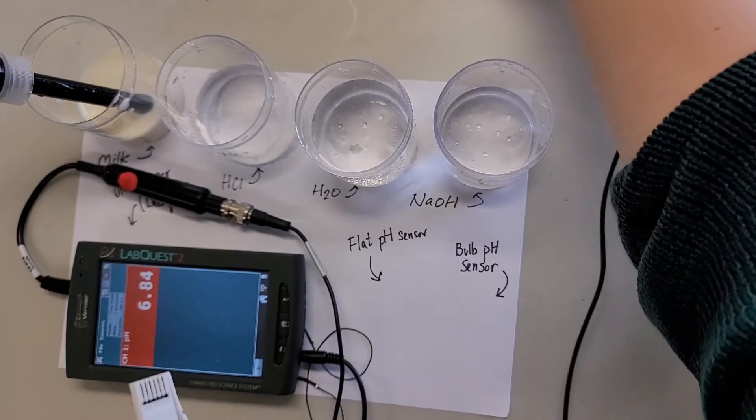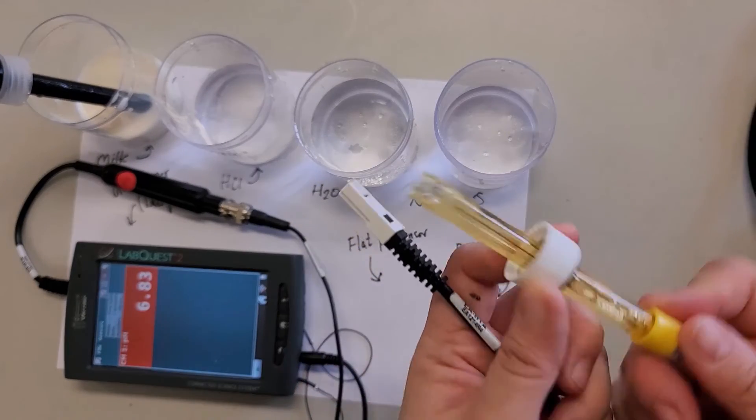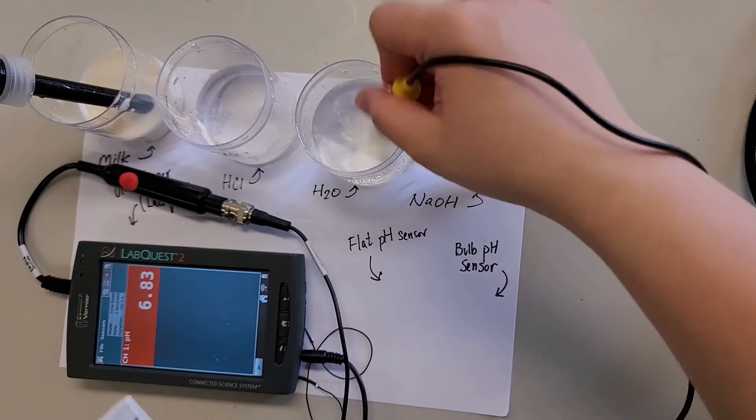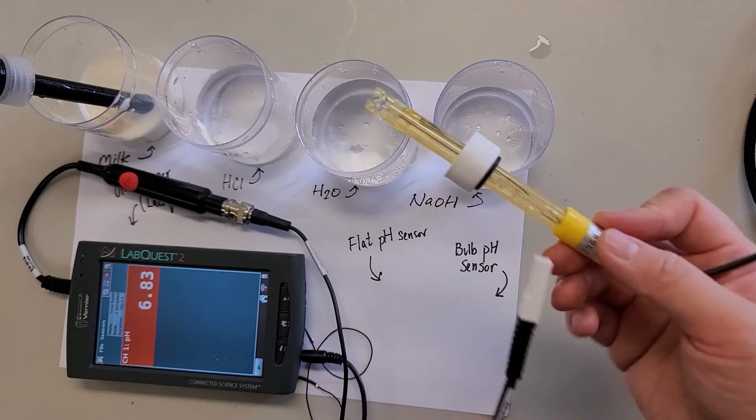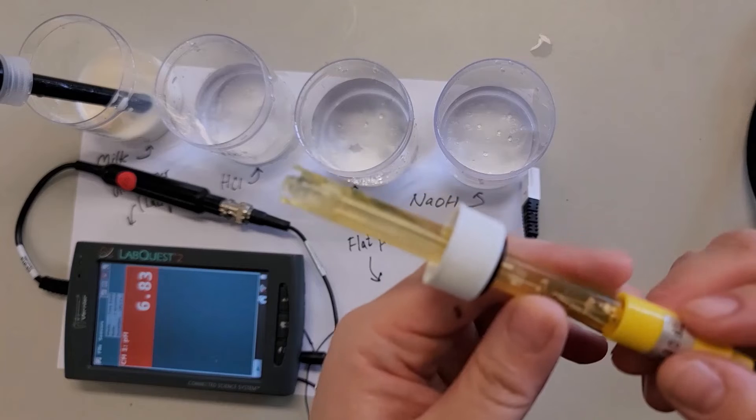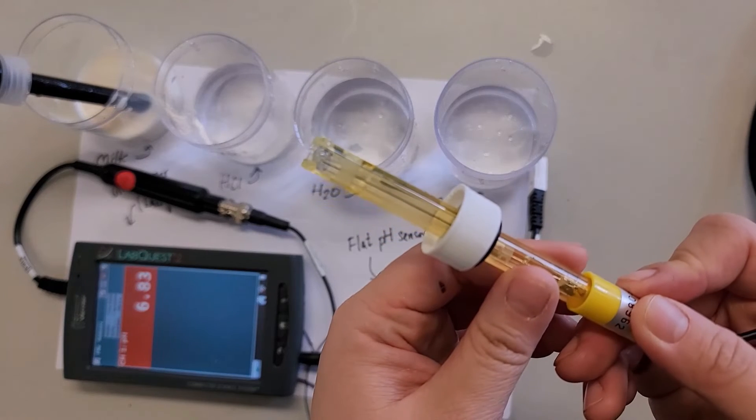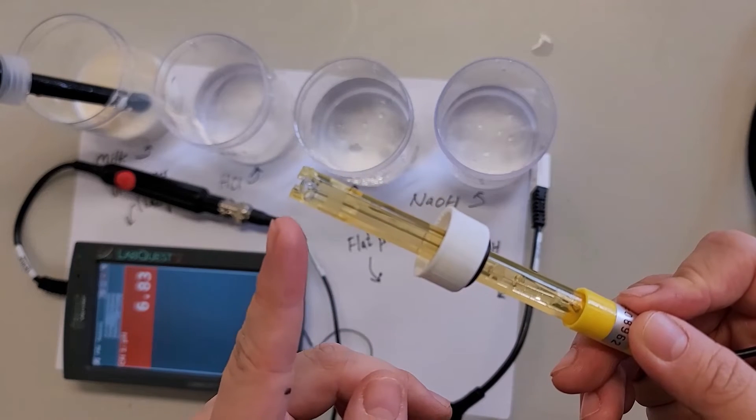Put it safe, put the buffer safe. Again, what we usually do is we rinse it with water first. Rinse it with water before and after use. Now, why do we call this a bulb pH sensor? You can see it close up. This is actually a bulb at the top. It's kind of like a light bulb here.